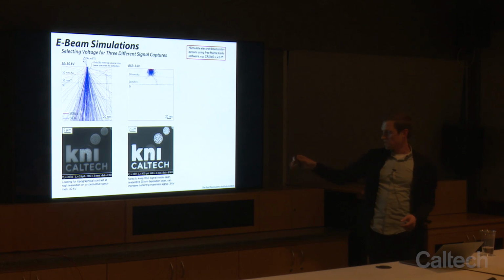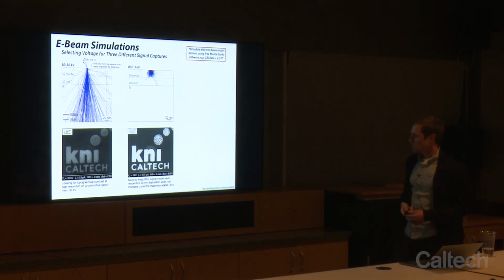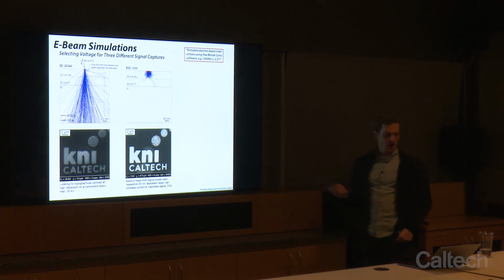And so that's 3 kV. It's a higher current, about an order of magnitude higher, 500 picoamps, and I used a different working distance. And again, I'll talk more about that.